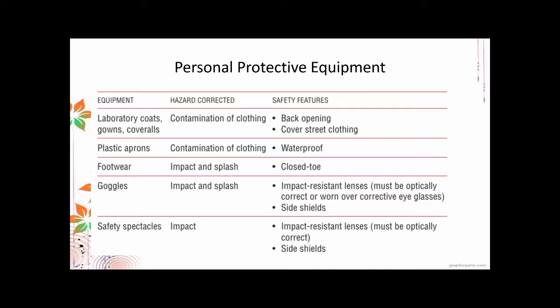So the best laboratory coat is actually a back opening coat, because for our class laboratory in school laboratories, we are using the front opening lab coat, but the best lab coat is actually the back opening, because when looking at PPE, your front area is always the dirty area, and your back is always the clean.